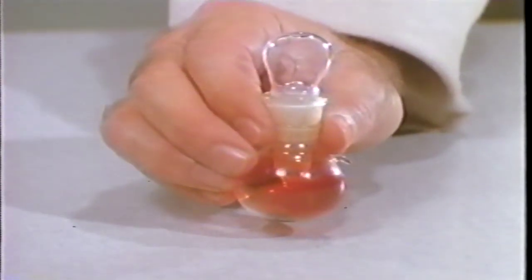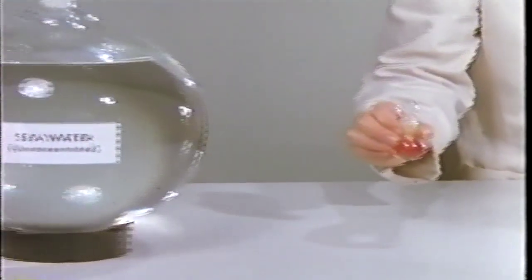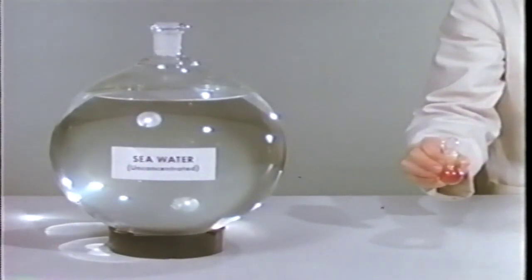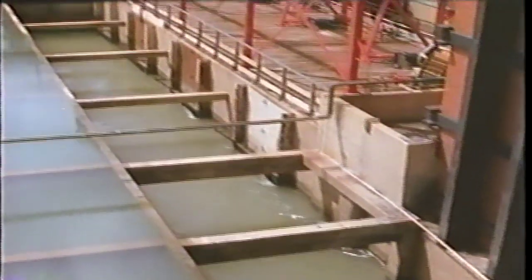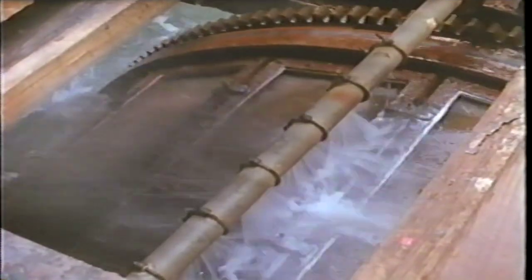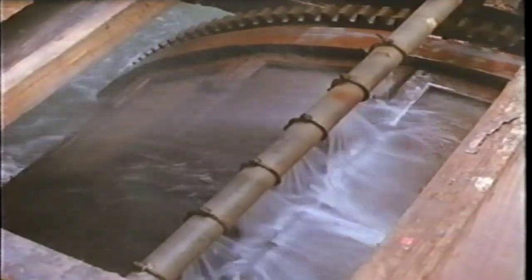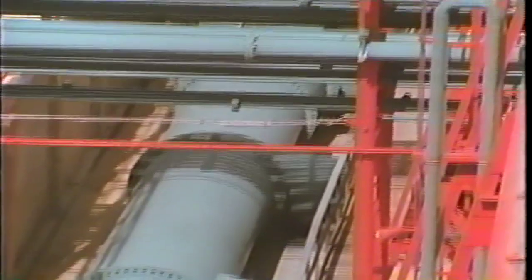On a laboratory scale, we have succeeded in obtaining this small quantity of bromine, less than 1 gram, from this large volume of seawater. Industry worldwide extracts more than 40 million pounds of bromine from seawater every year. The seawater enters a channel and flows past screens which prevent marine life and debris from entering the plant. Now, recall our laboratory procedures as we look at the industrial process for extracting bromine.